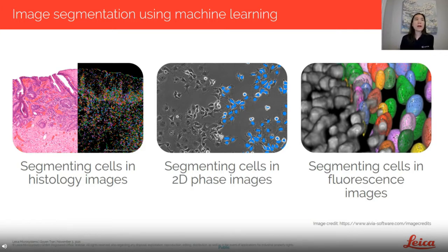And I really like using machine learning for detection of cells that are elongated or have a very unique structure to them. A lot of the algorithms that are commonly used are optimized for more globular cells, which makes it a little bit tricky if your cells don't conform to that morphology. So the pixel classifier allows you to expand that a little bit more and capture cell morphology that is elongated or just irregular.